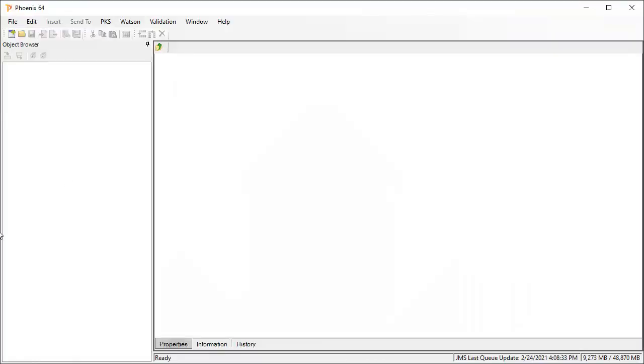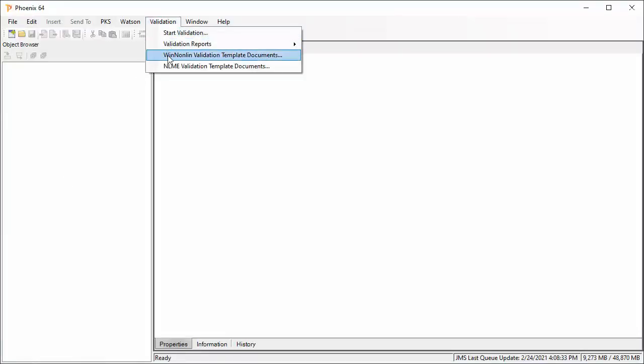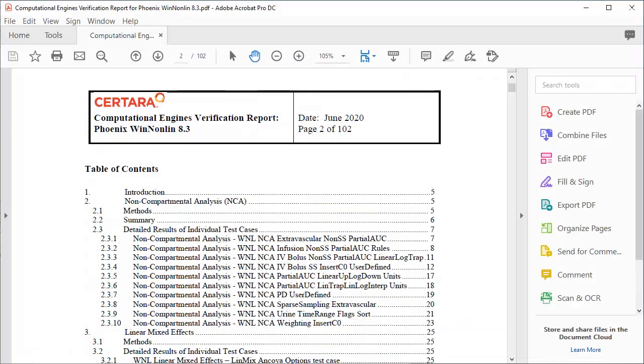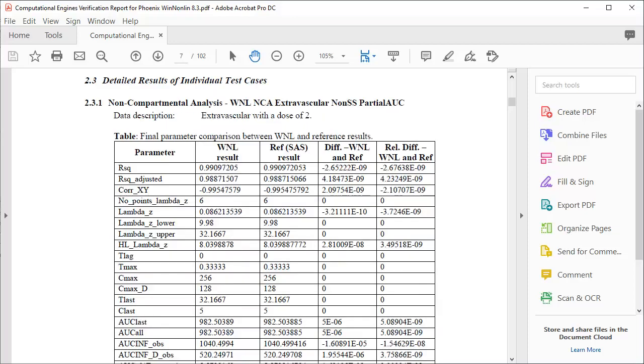The Validation Suite also provides several useful report documents that you can use. One important document is the Computational Engines Verification Report. This document provides all the automated tests in the Validation Suite and shows all the expected results of each test.